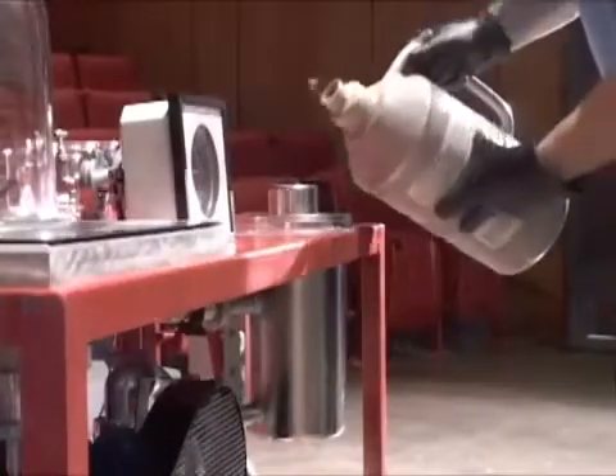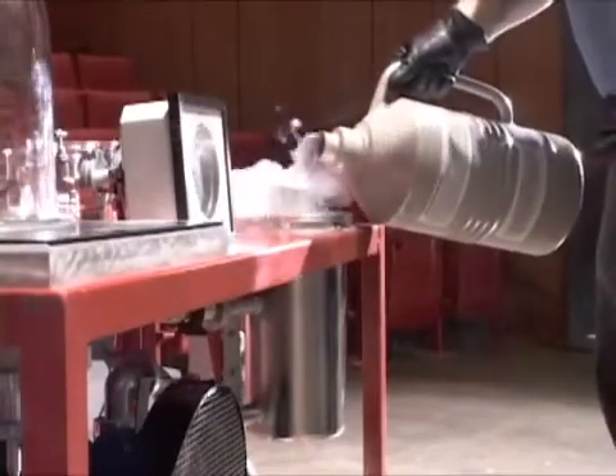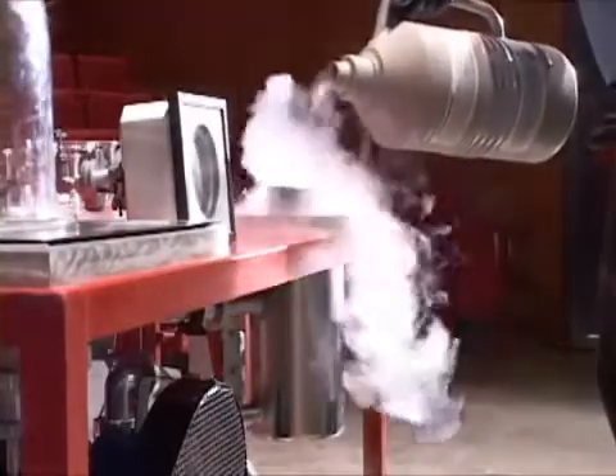First, we fill the cold trap with liquid nitrogen. This will prevent any water from entering the pump.